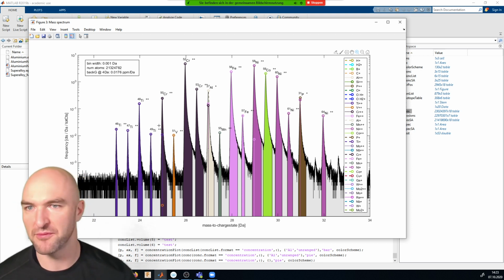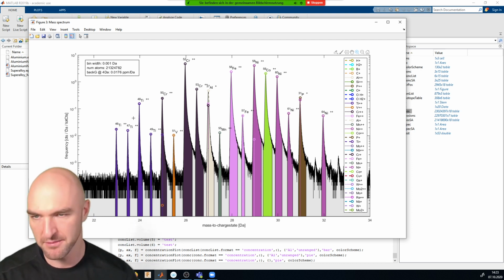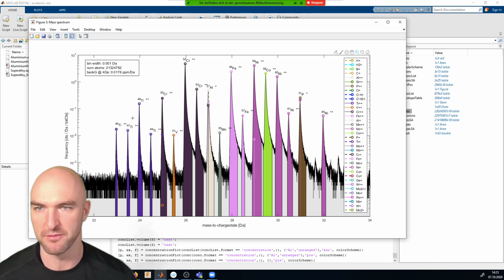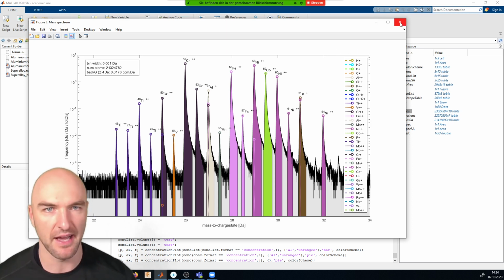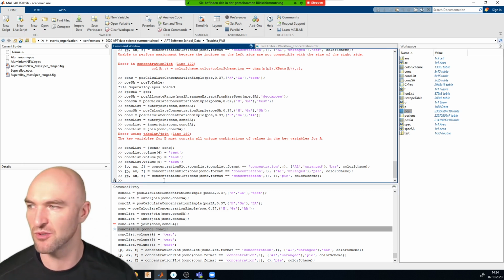Anyway, so I think in the future it's going to be very important to be able to write little programs that can make sense of concentration, not just from individual atoms, but from collective POS files or subvolumes thereof. And yeah, Andy London has already done a very good job at that. And this is why we will obviously go and steal their code, because it's also in MATLAB.